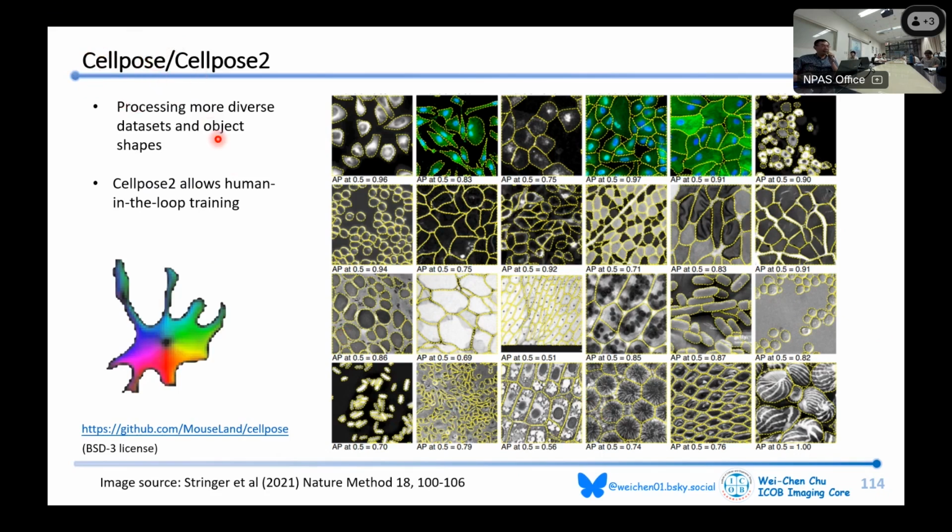But later they found that is not a very good idea because some variation may appear. Sometimes with different cells, only one algorithm is not a very good way to distinguish the different types.